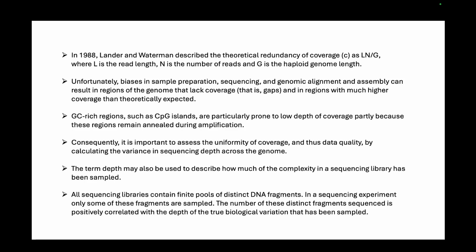So these are the kind of techniques that variant calling software uses. For example, when you're calling structural variations, or trying to see single nucleotide variations inside your genome, you use techniques like this. Has your depth increased at that particular point, or has it decreased? If it has decreased, then one reason might be that it has been deleted. It is possible. One or two reads have been generated, but the rest of your genome is at 10x. In that portion, only one or two reads are there. So it is possible that part of that region has been deleted in your genome compared to the reference.